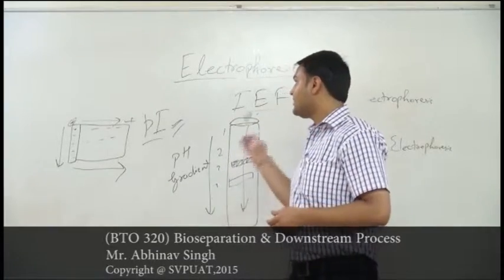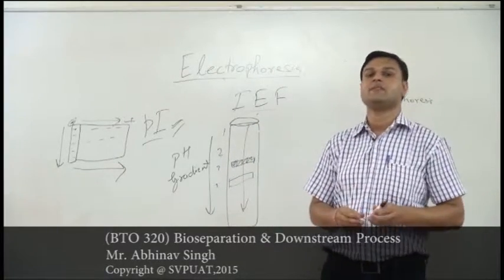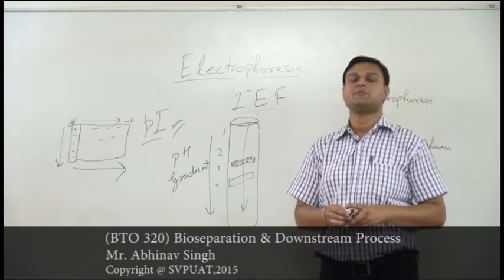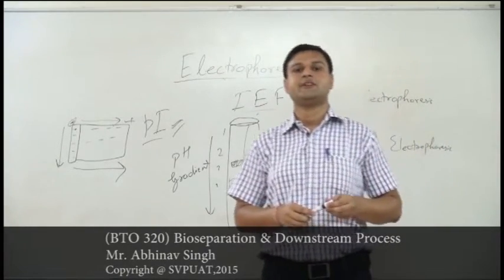So this is all about the electrophoresis technique, which is a very important separation technique, not only for laboratory purposes but also for commercial or industrial purposes.